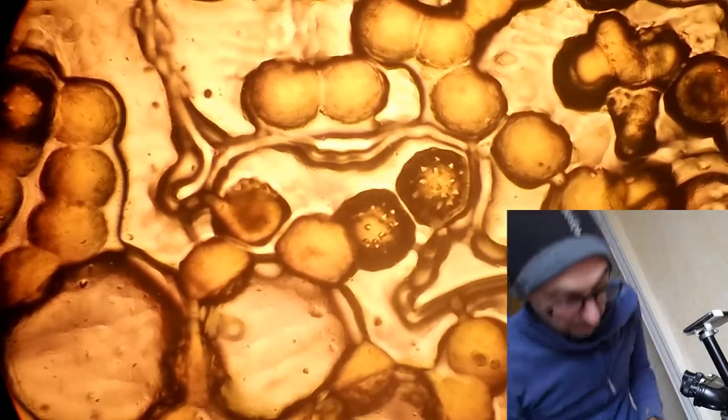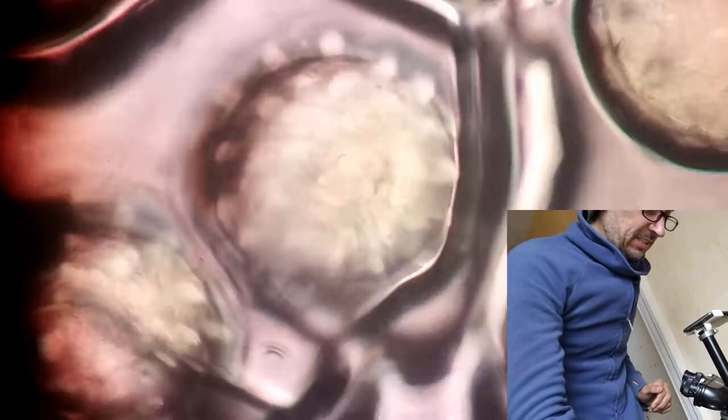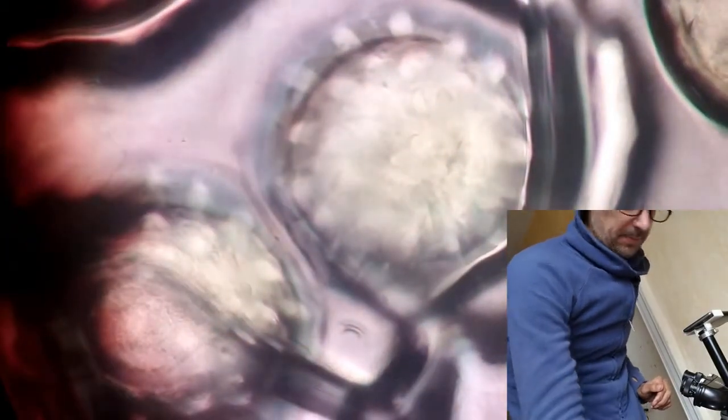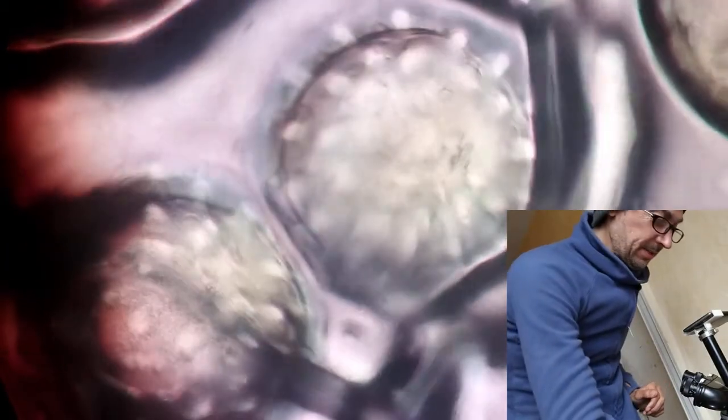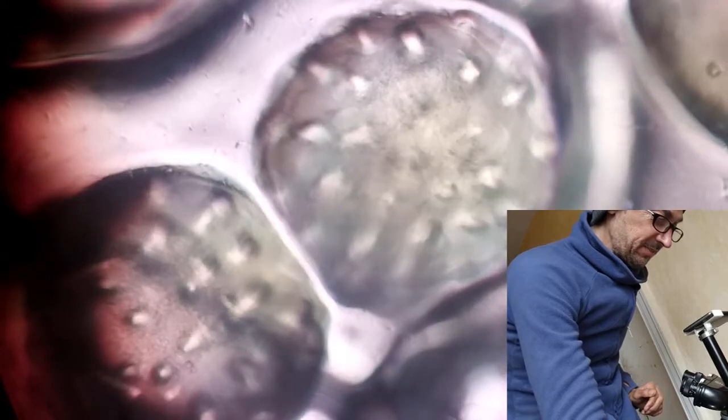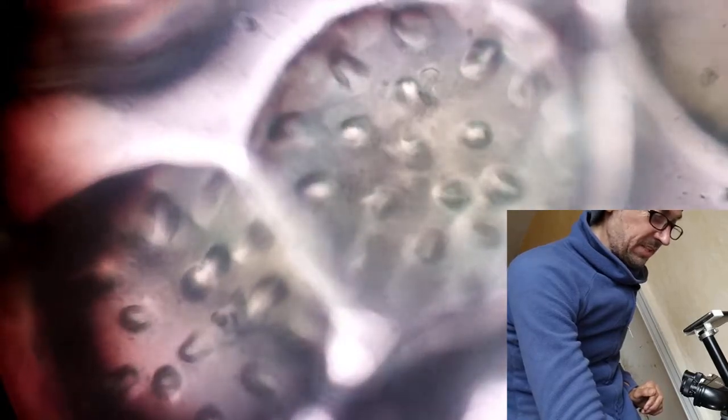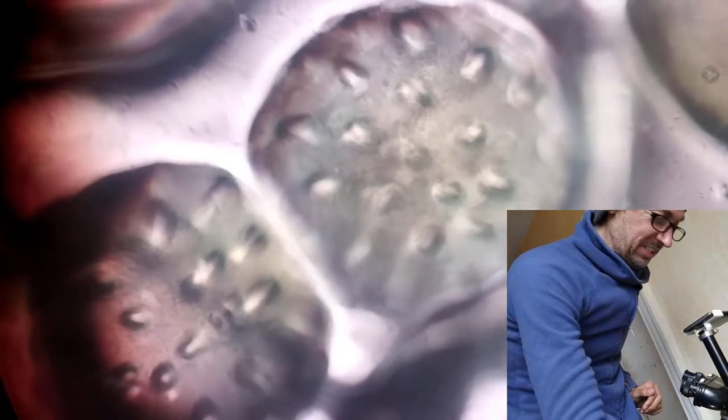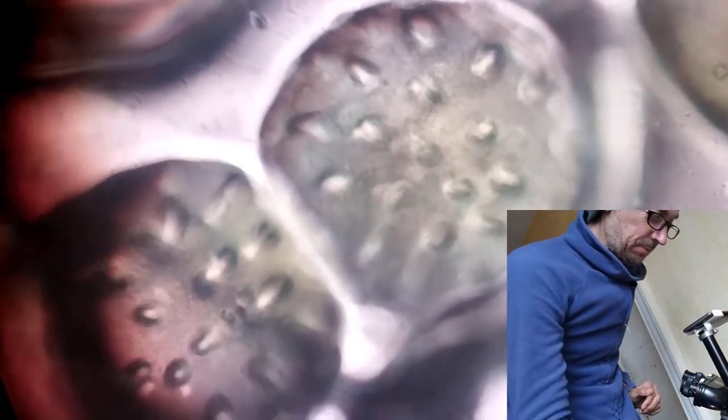Now we go to 40x - that's 400x total magnification. Let's try to get this very sharp. You see now the spikes become really more clear, but it's still a ball with spikes.